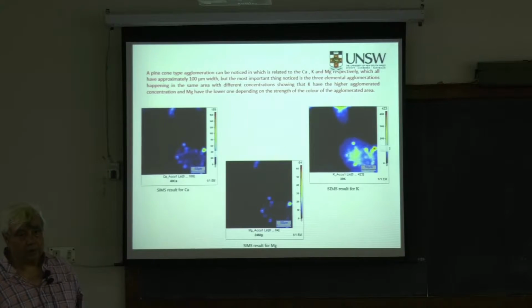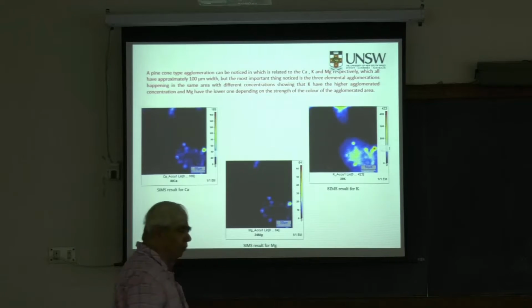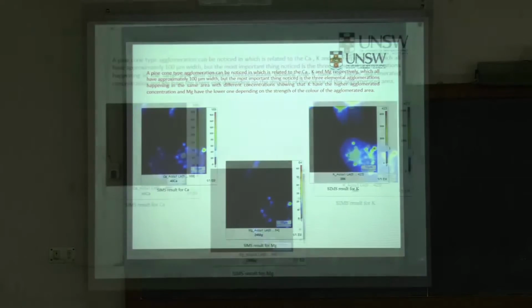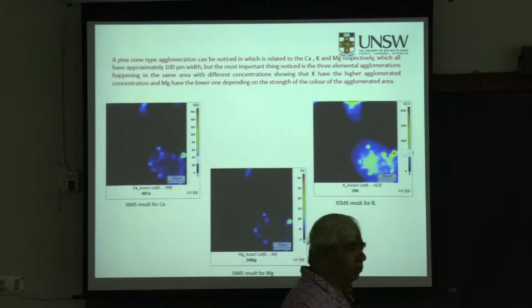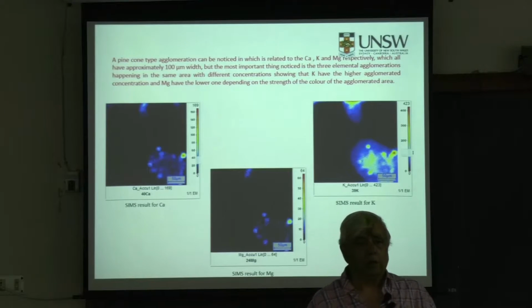in our university also. But what happened, the Australian Nuclear Science and Technology Organisation, ANSTO, provided special funds to some universities, and energy dispersive spectroscopy was considered to be a very good thing. But when we have done the SIMS, it shows that SIMS can give you much more information.